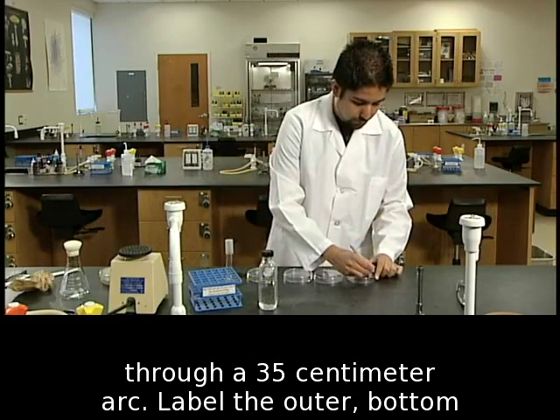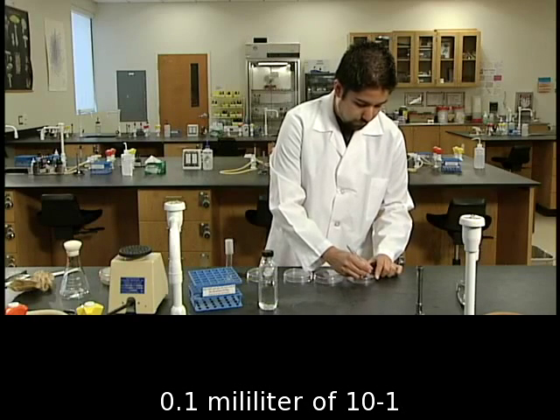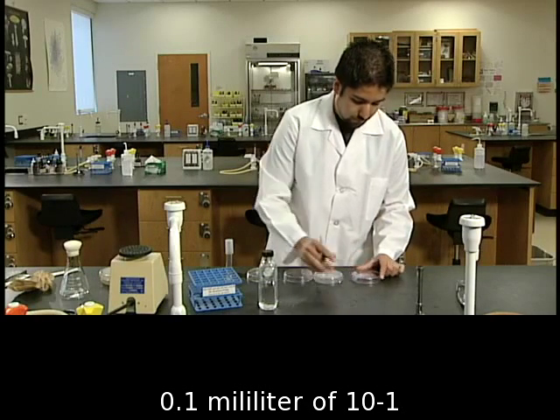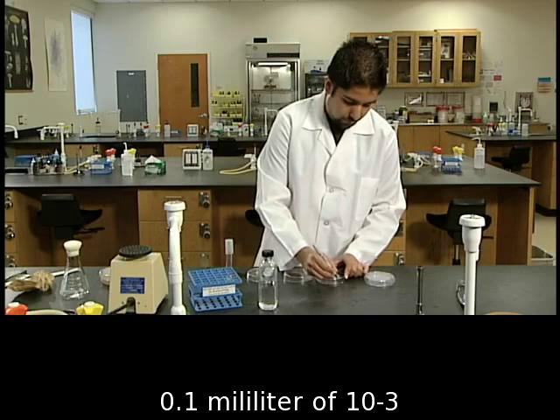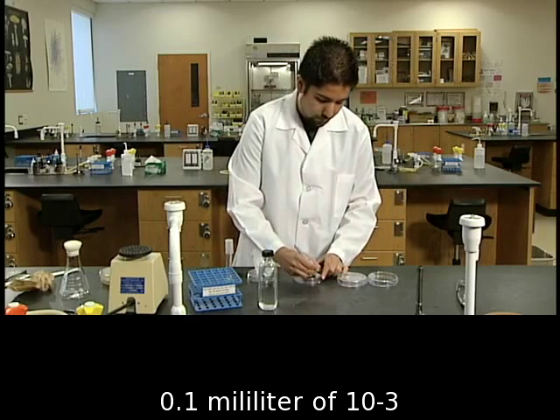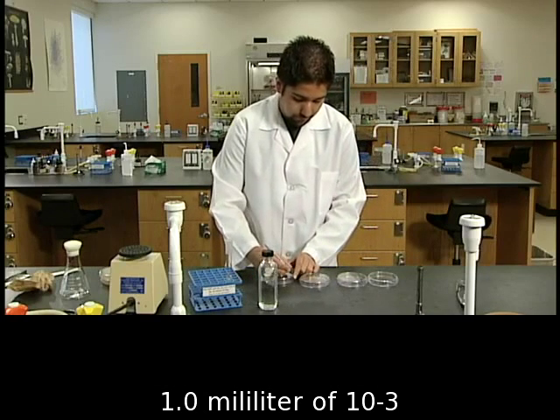Label the outer, bottom edge of 4 empty sterile Petri dishes: 0.1 milliliter of 10 to the negative 1, 1.0 milliliter of 10 to the negative 1, 0.1 milliliter of 10 to the negative 3, 1.0 milliliter of 10 to the negative 3.